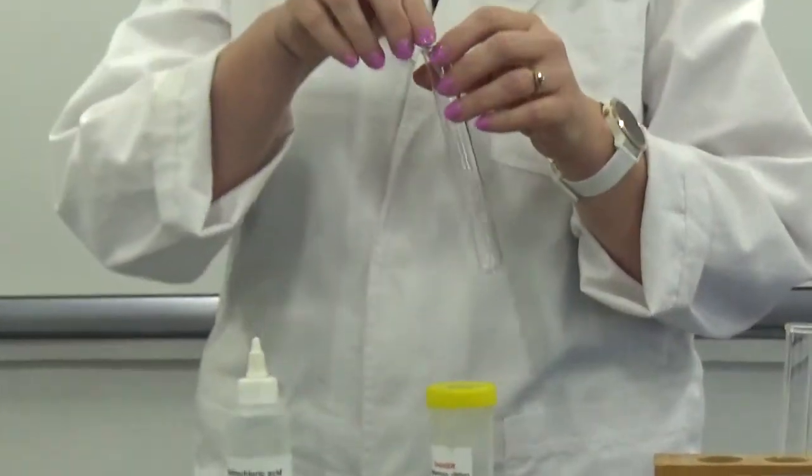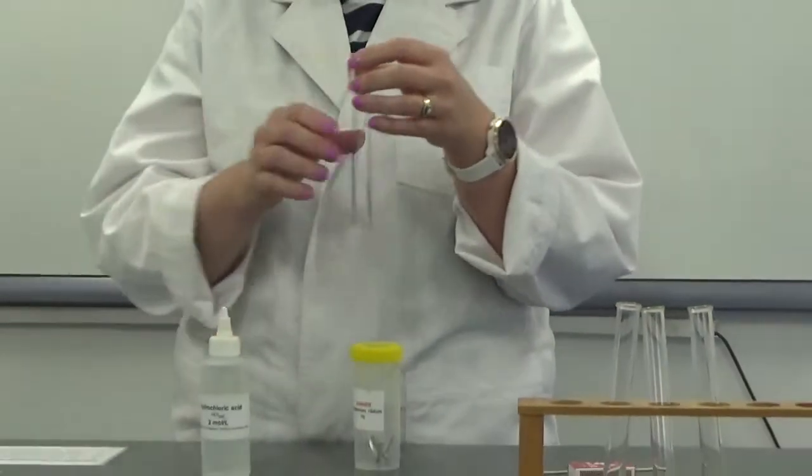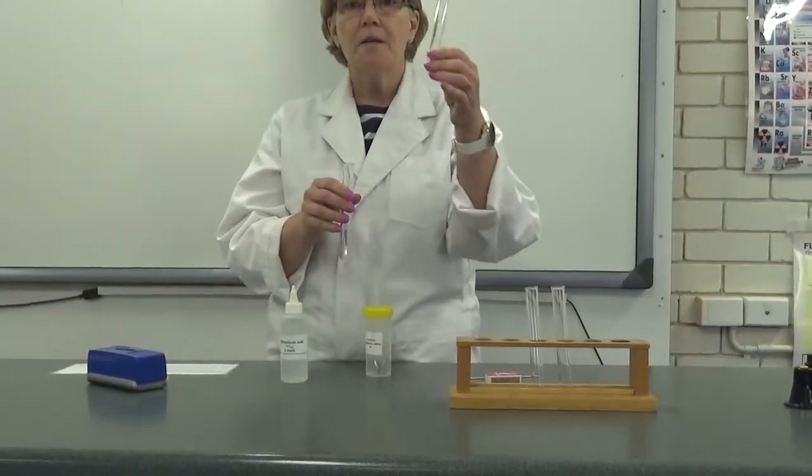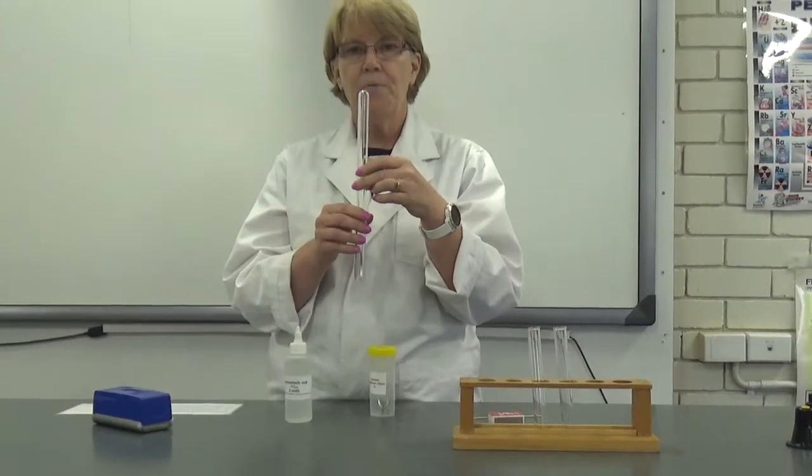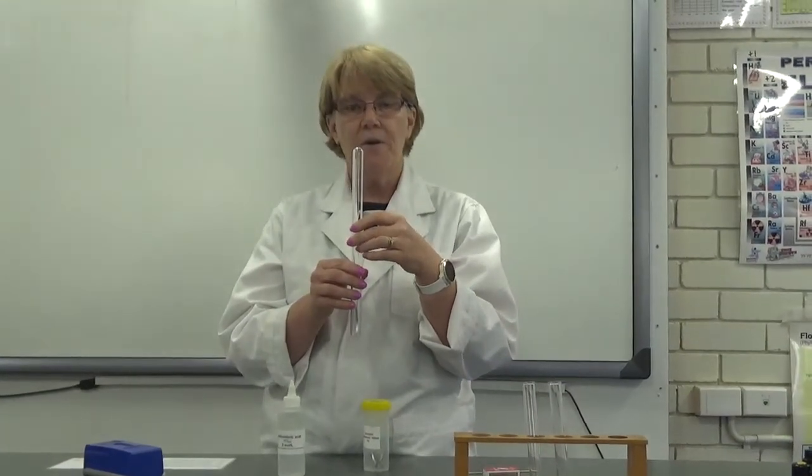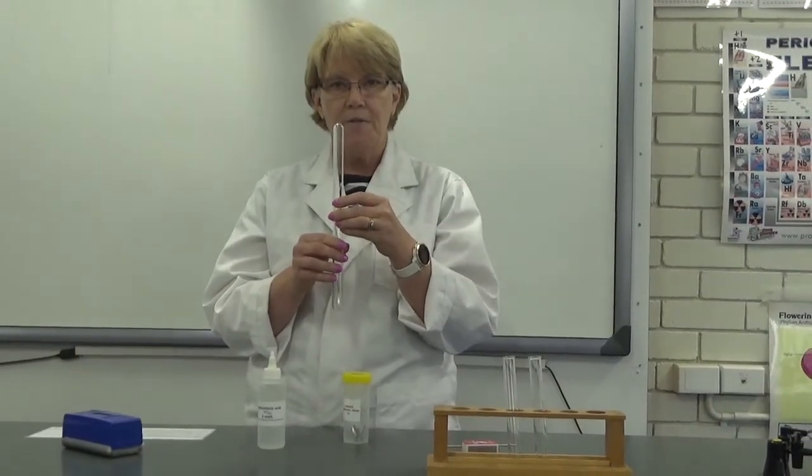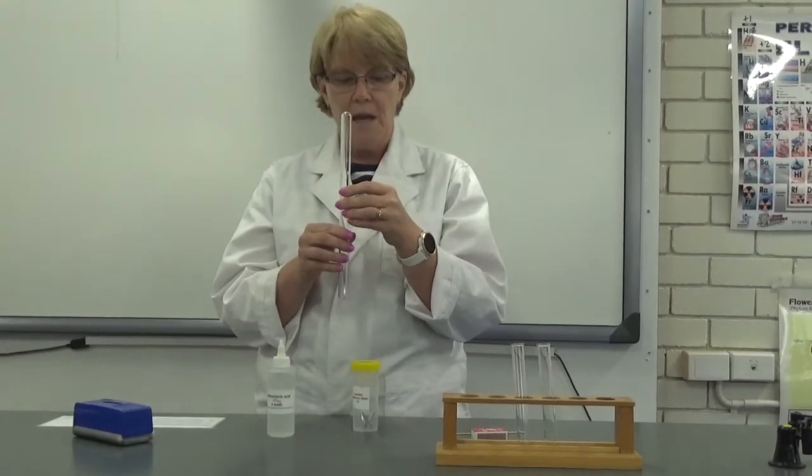I'm going to put the magnesium in the test tube. I'm going to add some acid, and I'm going to collect the hydrogen gas that should form by putting another test tube over the top. The reason that's going to collect the hydrogen is that hydrogen is a very low-density gas, and it's going to float upwards in the air.